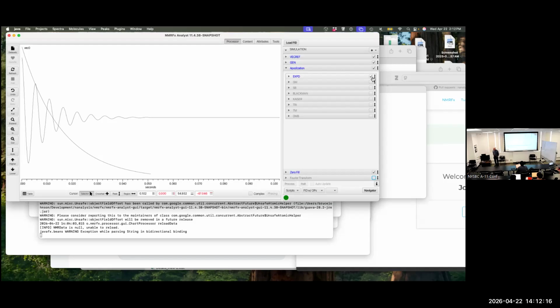So we need to at least get the signal down to zero. Then we have other factors. When we do the exponential decay, we're basically increasing the width of the line. We're increasing the natural decay of the signal. So that's not good. We would rather not increase the width of our lines. So we can look at other factors. We're also advantageously reducing the amount of noise, relatively.